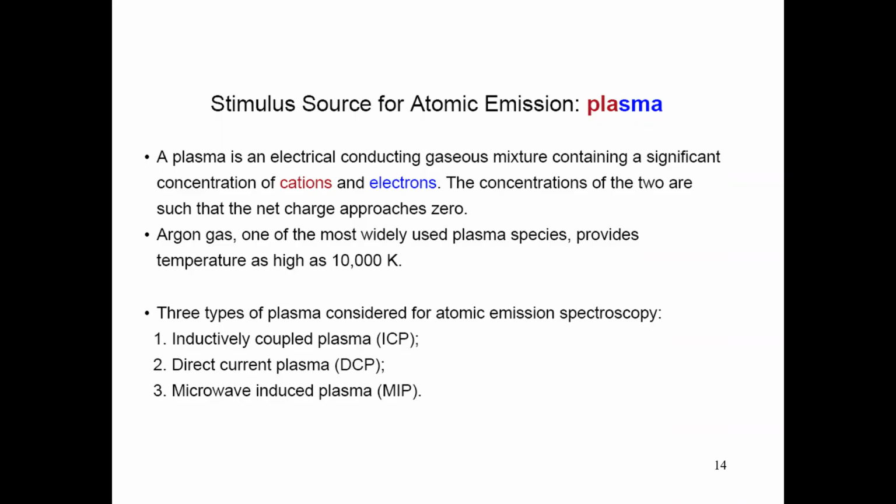Yes, it's inert, so it doesn't react, although it forms other species, but relatively it's inert. We use it for that case, but it will react and form other species, we'll see later. Like oxides, ArO, and OH, and so forth. That's one of the problems with this.